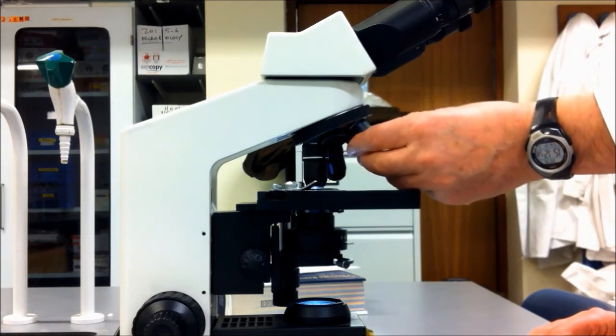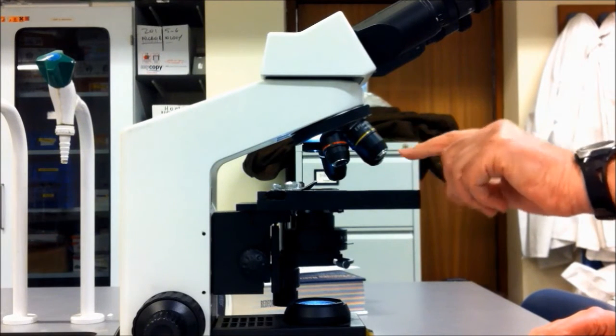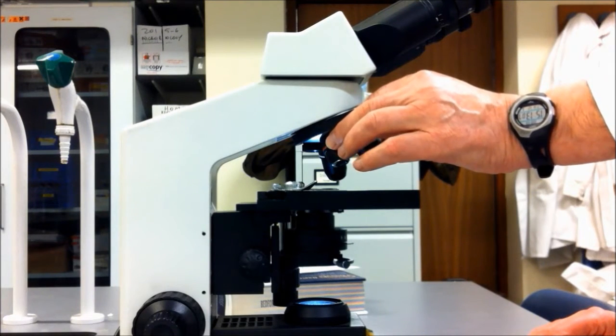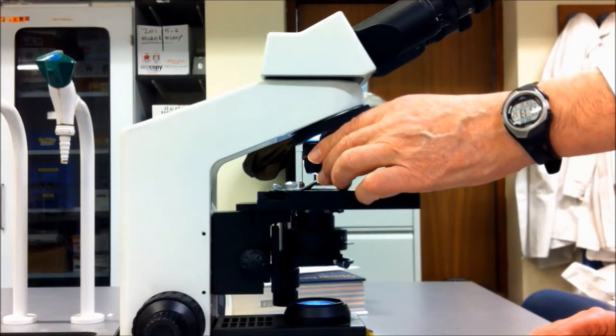The red is 40 times magnification. The blue, slightly longer, is 400 times magnification. And the silver is 1000 times magnification.